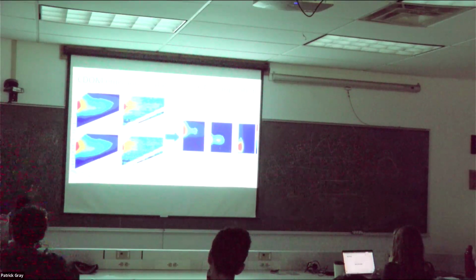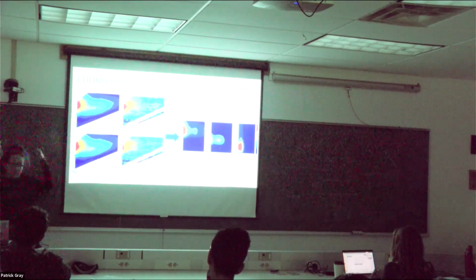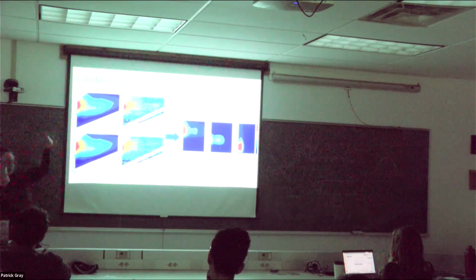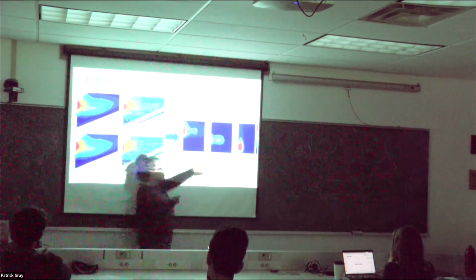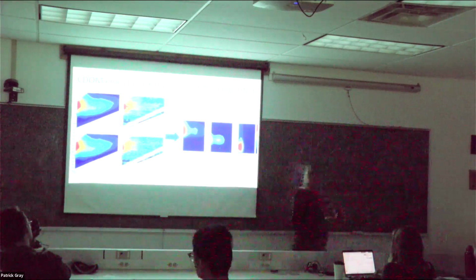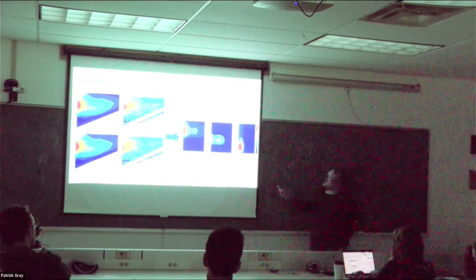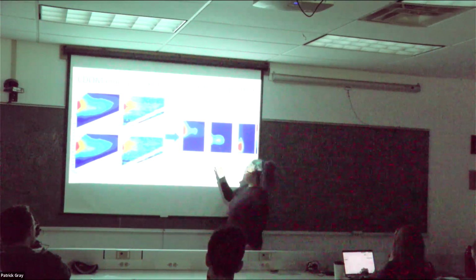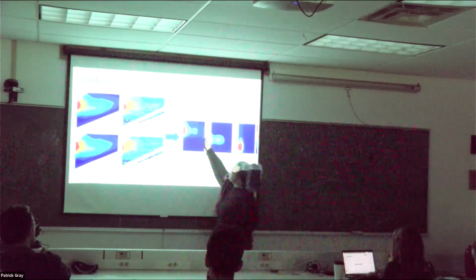And so what does that give you? What does that tell you? Well, it tells you so much more than just measuring it with one wavelength of excitation of CDOM and one wavelength of emission. You can start differentiating different sources of dissolved organic material in your environment. You can start separating, based on previously published known values, some terrestrial inputs, no?